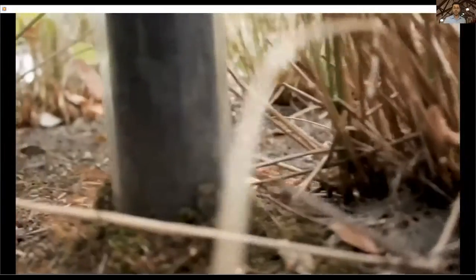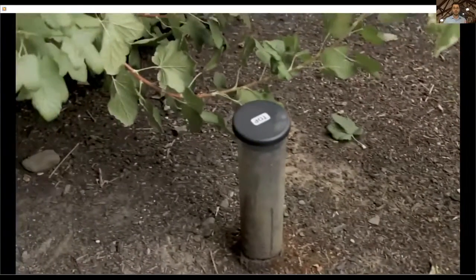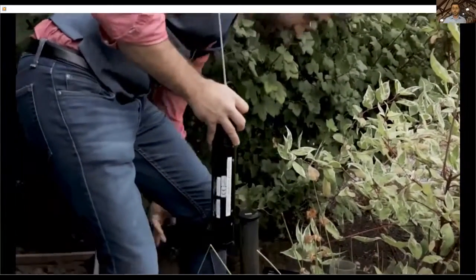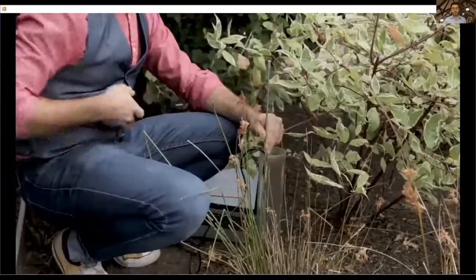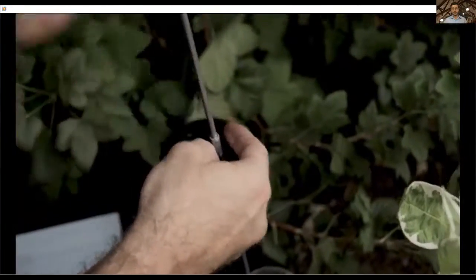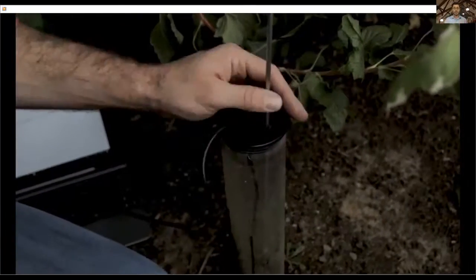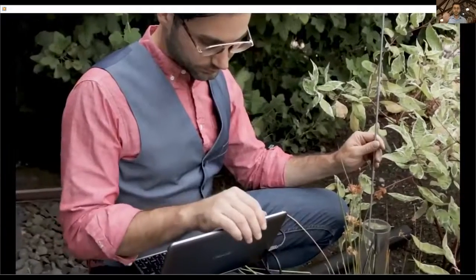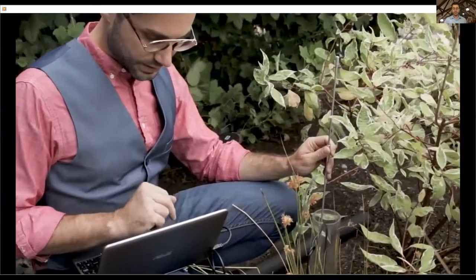These are some tubes we have actually installed in our own area. We do put a foam core in to keep the UV light out, but as you've seen, duct tape, PVC pipe, there's a lot of different methods to make sure that roots are growing in that area. And here, we're actually putting the locking cap on. This locking cap you use to make sure that different environmental effects, UV, moisture, aren't getting down into there and changing the environment, as well as you can actually lock it in place with the slider rod and just change the depths that you're using it at.